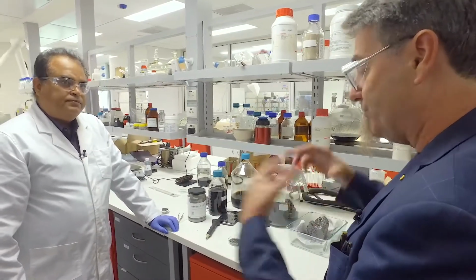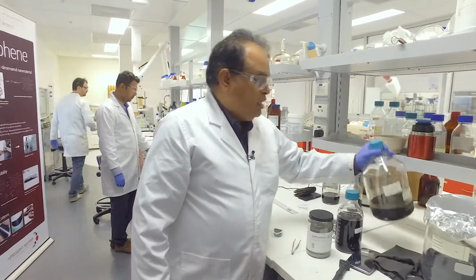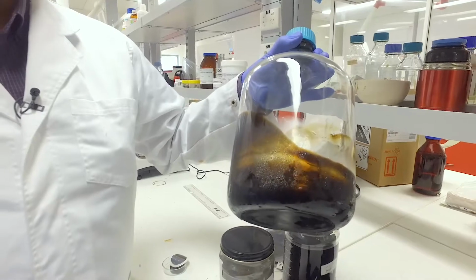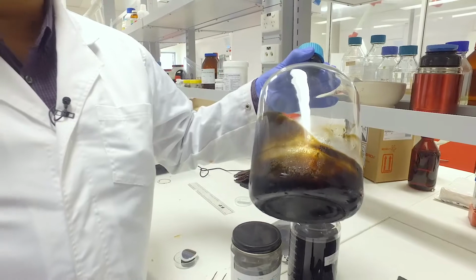And does that cause it to break up into the individual sheets? Absolutely. This is what we have been getting. This is the graphene oxide, which is a very large sheet of graphene oxide, around 50 to 70 micron sheet, which is having a unique property, forming the liquid crystalline nature of the material as well.